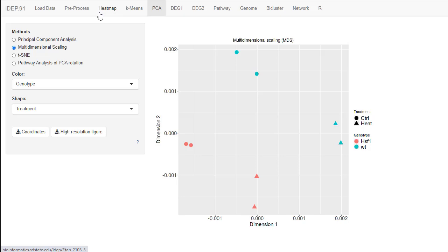It's starting to form an intuitive understanding of your data, which is very important, I think. So some people jump directly to differential gene expression and pathway analysis. To me, I think that skips a very important part from both the quality control perspective and the verification confirmation perspective.